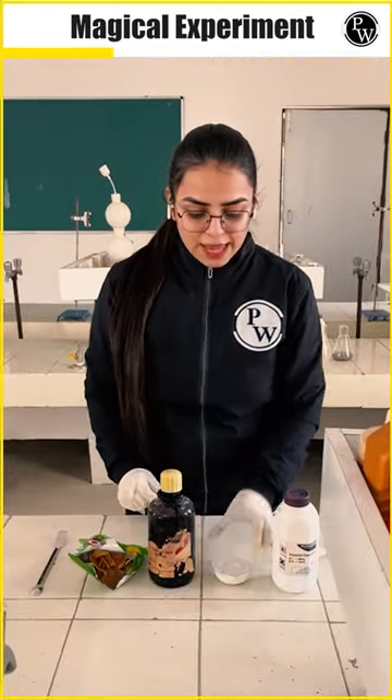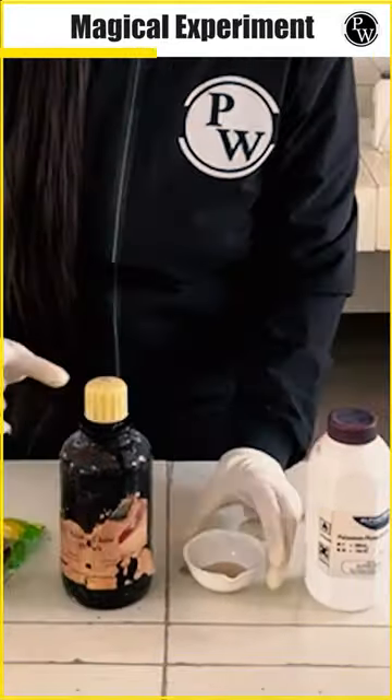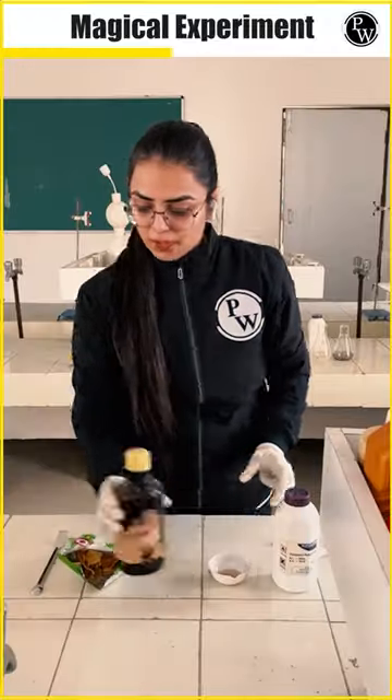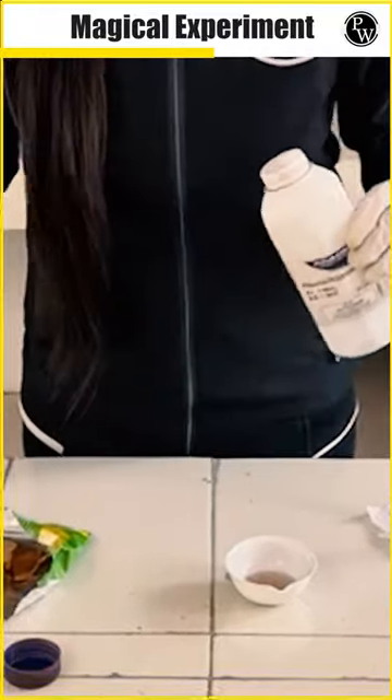So now, what I am going to do is, I am going to take H2SO4 over here. I am going to take now potassium permanganate and we are going to put it over here.